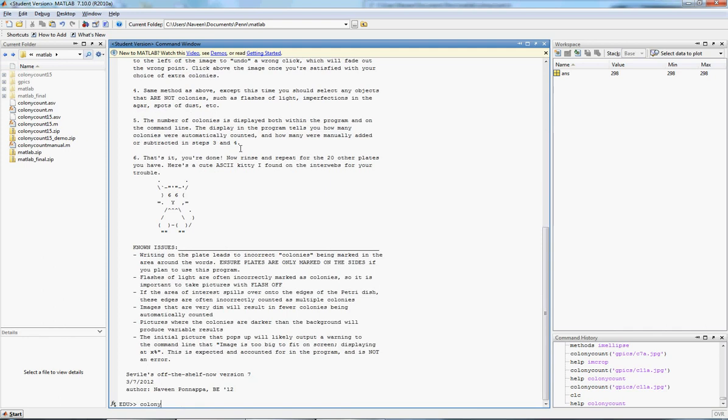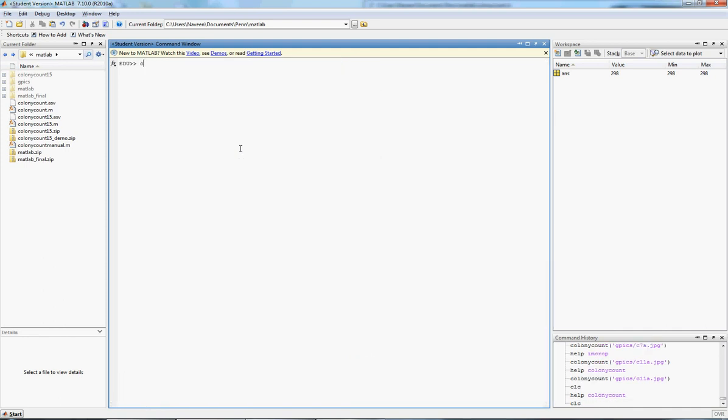From there, we can now type in the name of the program and the exact location of where the image is that you want to count colonies on, with the JPEG or the PNG or whatever the file extension is.